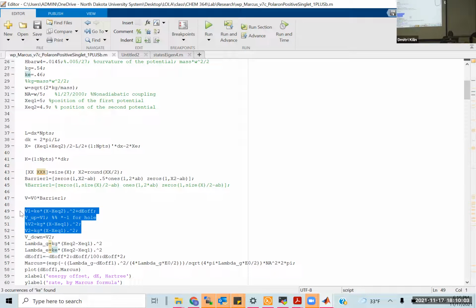By manipulating values of parameters for these equations, one can get different spectra, and one can select such parameters to make this reproduce emission of your copper spectra. So the DE must be your HOMO-LUMO gap. So if you can start playing with it.